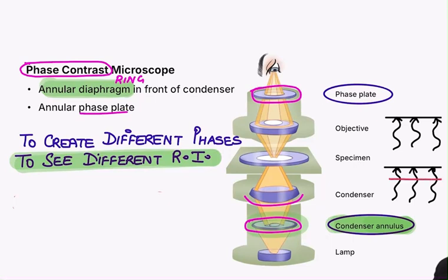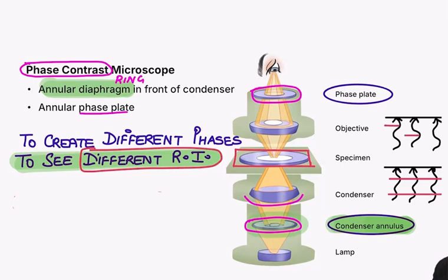You can see in the form of these curvatures, their phases are the same. But as soon as they hit the specimen, because the specimen has different refractive indices, I see that these phases have changed. Now see, this phase has shifted here and this has shifted there. Now it's no longer in the same straight line like it was. Can I say that there has been a considerable phase shift in the light?